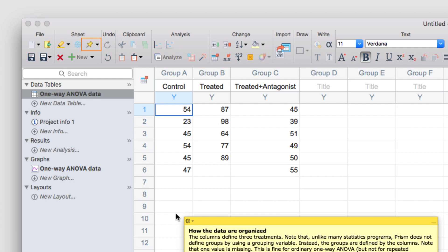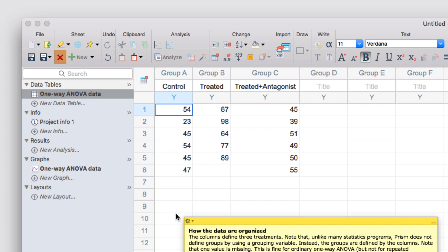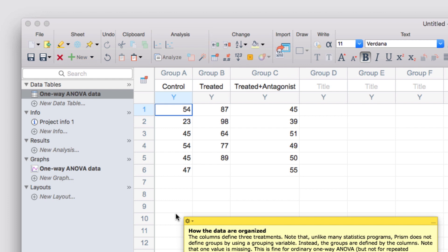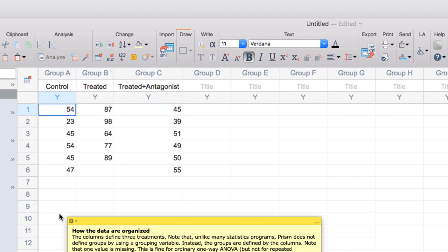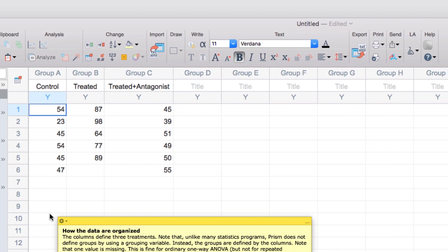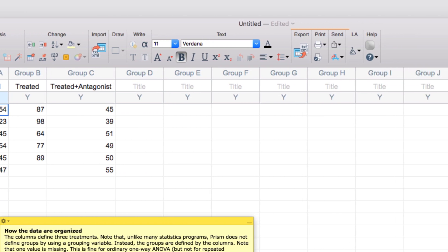Other important sections of the toolbar include the file section where you can create new projects or save your work. In the sheet section, in addition to creating floating notes, you can highlight sheets, create new sheets, or delete existing sheets. The analysis section we'll come back to in just a moment. The draw, write, and text sections are mainly for customizing your graphs and layouts, and finally there are a number of sections that allow you to export, print, and share your work.